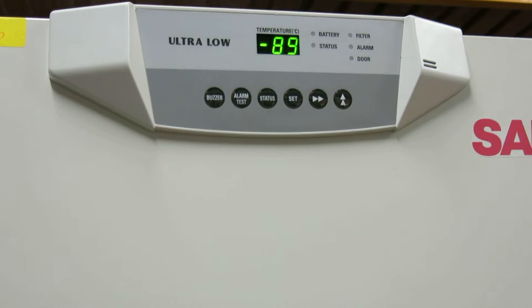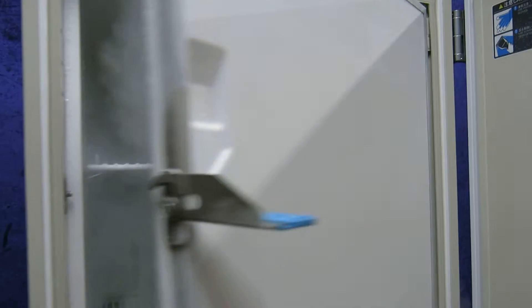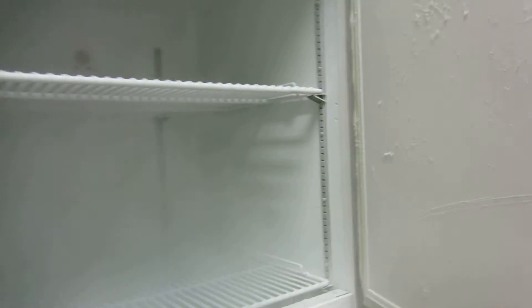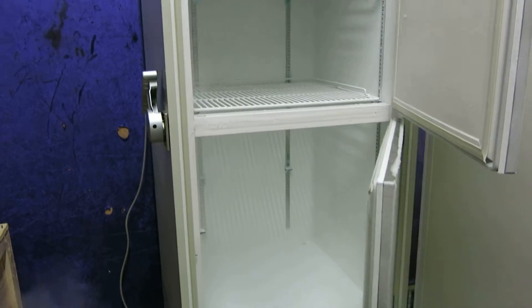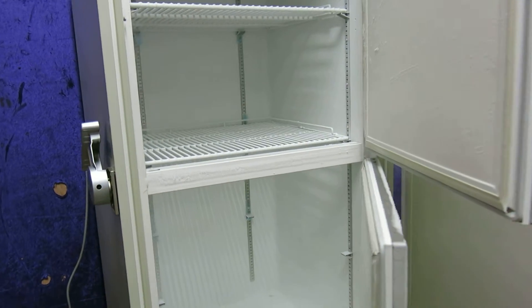It's in very good order. I'm now going to open it up. You can see the temperature here inside — or rather the steam come out of it.